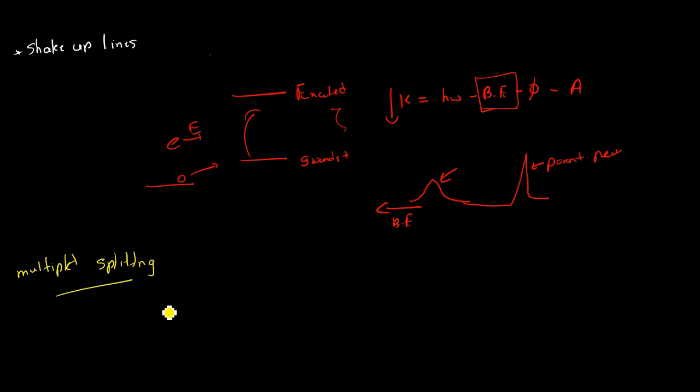So I will quickly go through multiplet splitting. This mainly happens with electrons which have unpaired electrons. Like when the sample is hit with the X-ray, right? Here you have the X-ray. Now electrons are to be emitted. So when these emitted electrons are from unpaired electrons, right? So unpaired electrons are there in the atom.